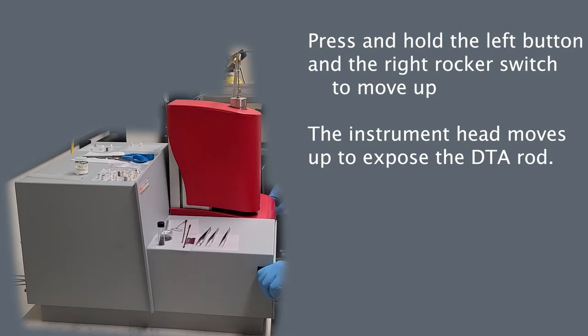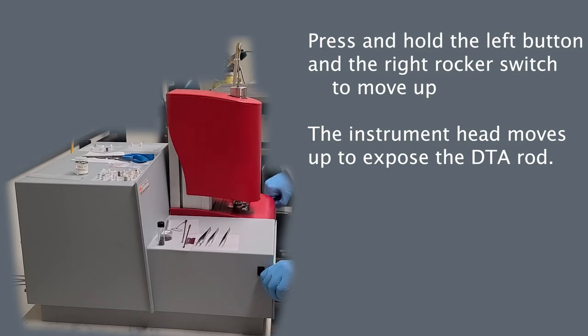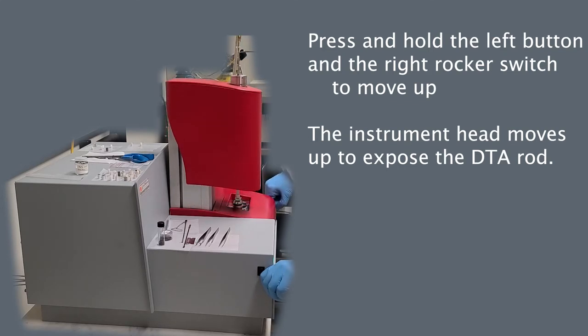The first step is to open the head assembly by pressing the left button and using the right side rocker switch to move the assembly up or down.